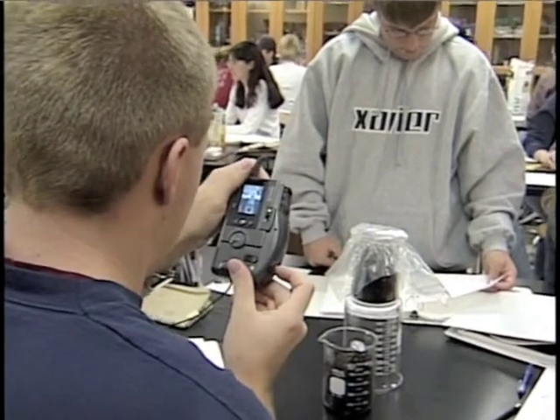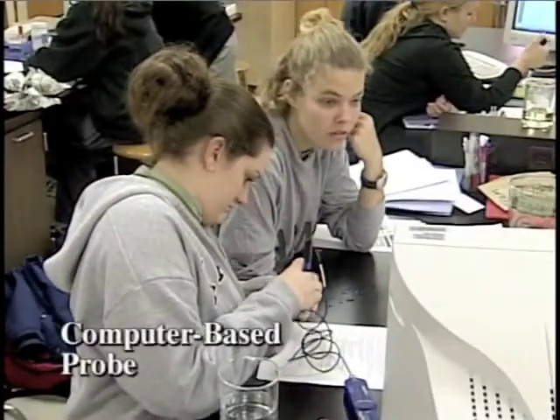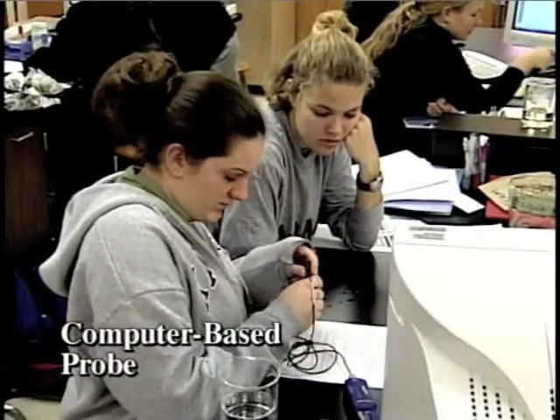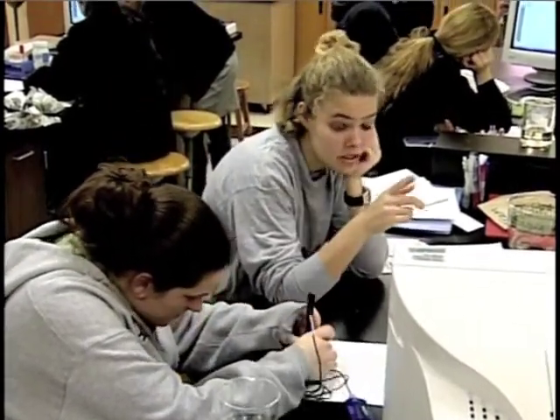What do you think? Okay, you have designated an independent variable. But it sounds like it might work out to what you're trying to do. Yeah. Lower, but higher acidity. Oh. Okay, so what you really have to do is start investigating some pHs. Like, what is the pH of that distilled water? I don't know. You better find that out. It's lowering. What is the pH? How long does it do this for? What is the pH of that? What happens to pH when... No, I think that's it by carbon?